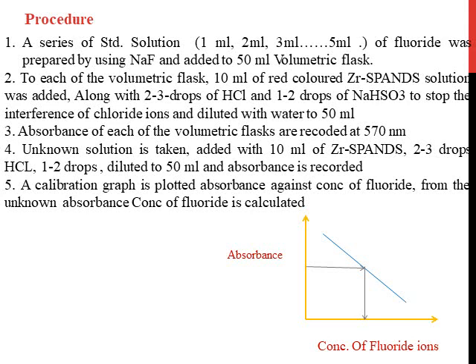So this is the procedure for calculating the concentration of fluoride ions by using colorimetric method.